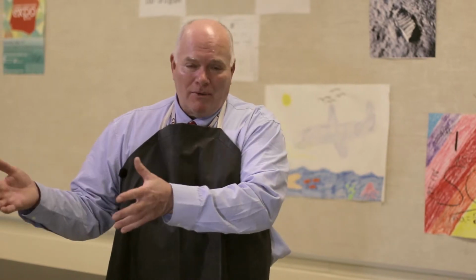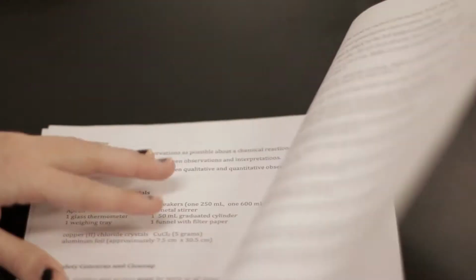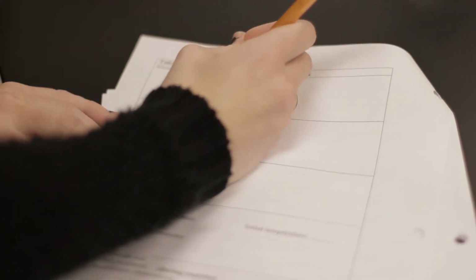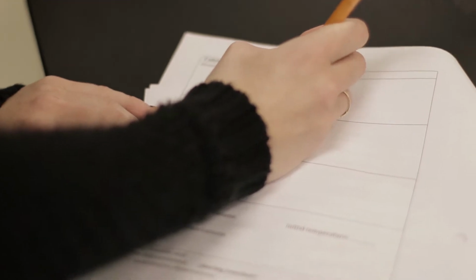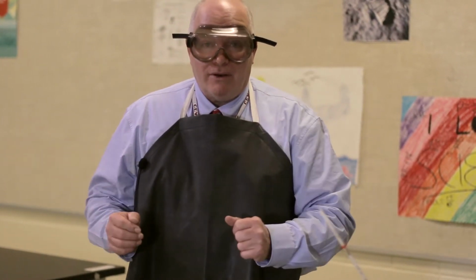So we take what they've learned in the classroom and now they get to actually practice it in a hands-on laboratory experiment. Make 3 to 5 observations on each. It reinforces chemical reactions, the things that they learned in the class.